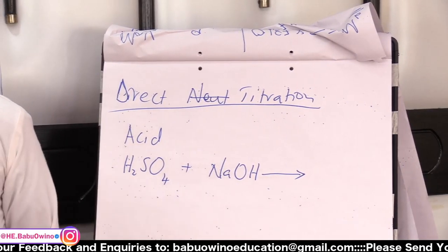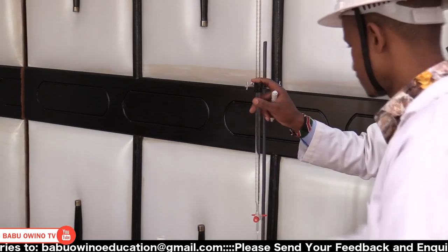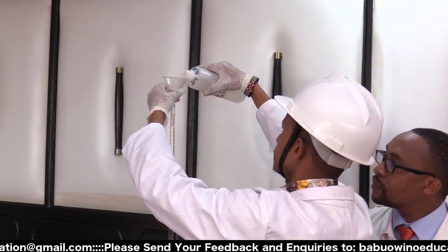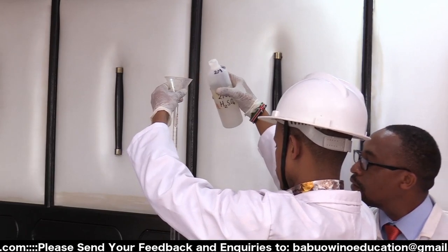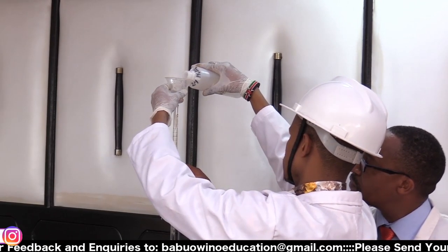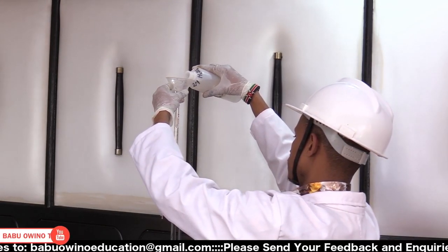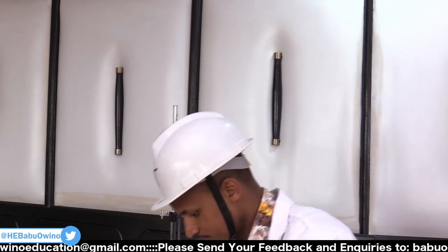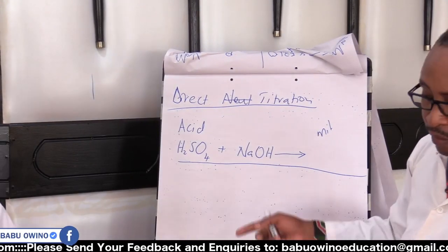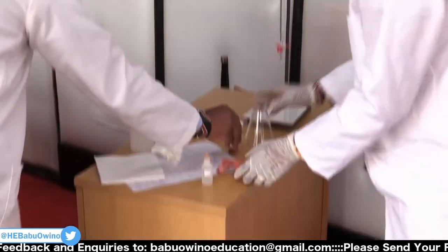So he has already rinsed this. In the burette, we'll put the acid. The other one, we used methyl orange. Now this is a strong acid and a strong base. We can use any. So this one we're going to use phenolphthalein. So we change the indicator and we use phenolphthalein.